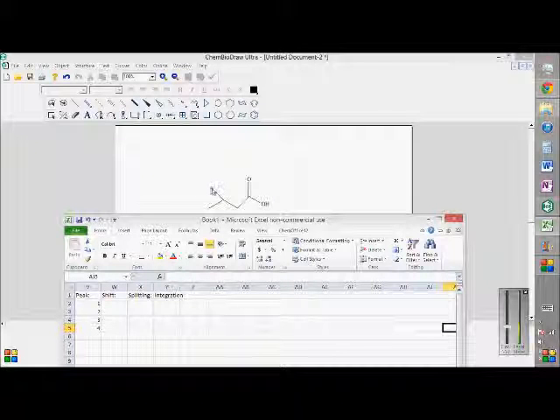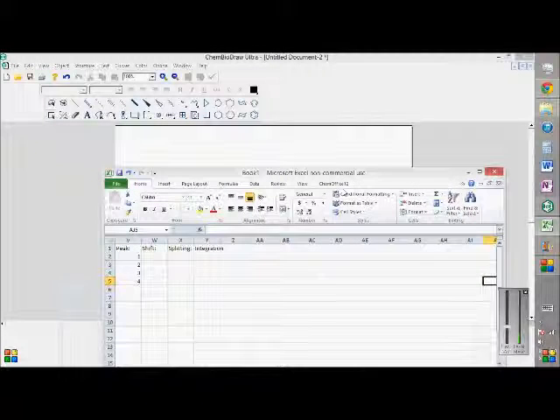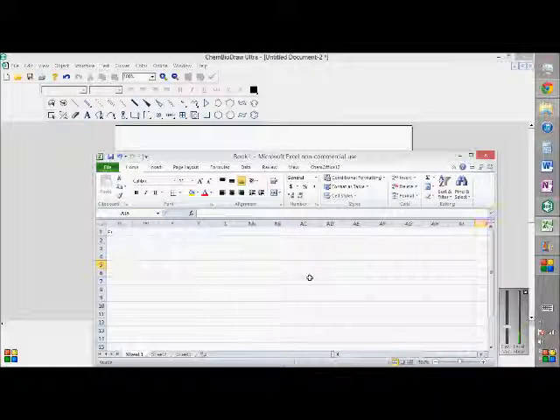There are 5 different carbons or other atoms with hydrogens in this molecule, but there will only be 4 peaks because this and this are in the same chemical environment. So we'll begin and we'll move left to right on our peaks. The farthest left is this, which should have a fairly normal shift of around 1 and should be split only once because there's only 1 here, making it a doublet because the splitting is the number of adjacent hydrogens plus 1. This will move on and on, and that will give you a table that looks something like this.